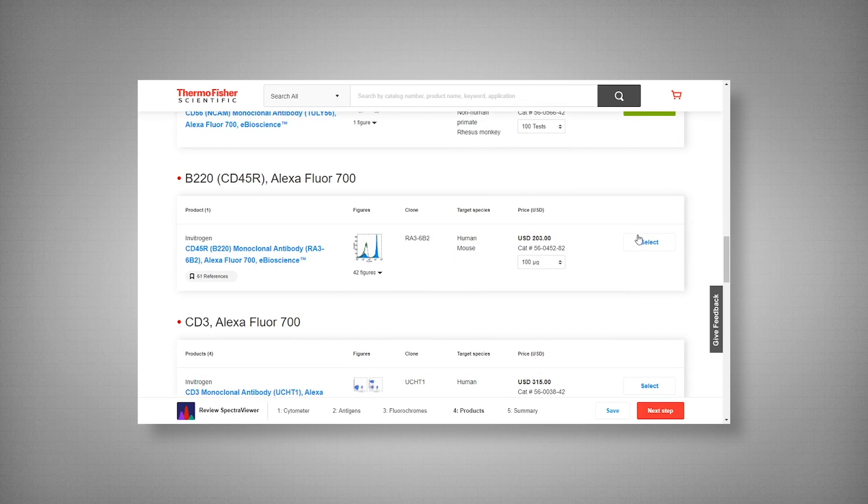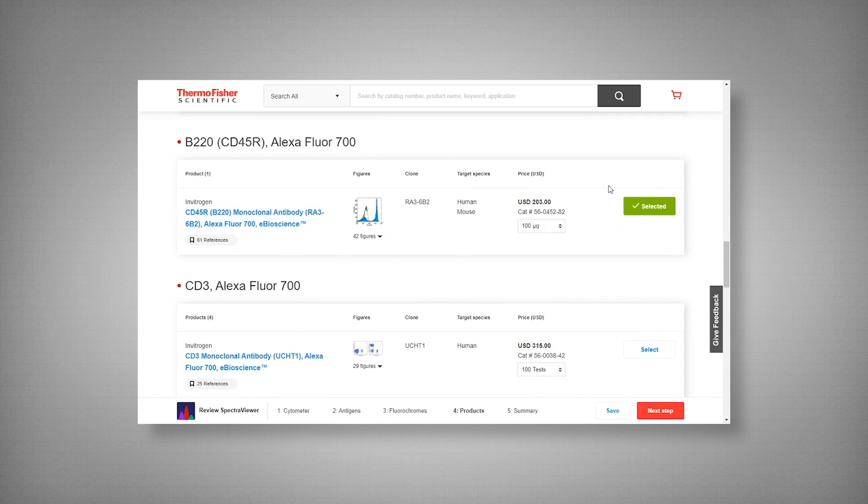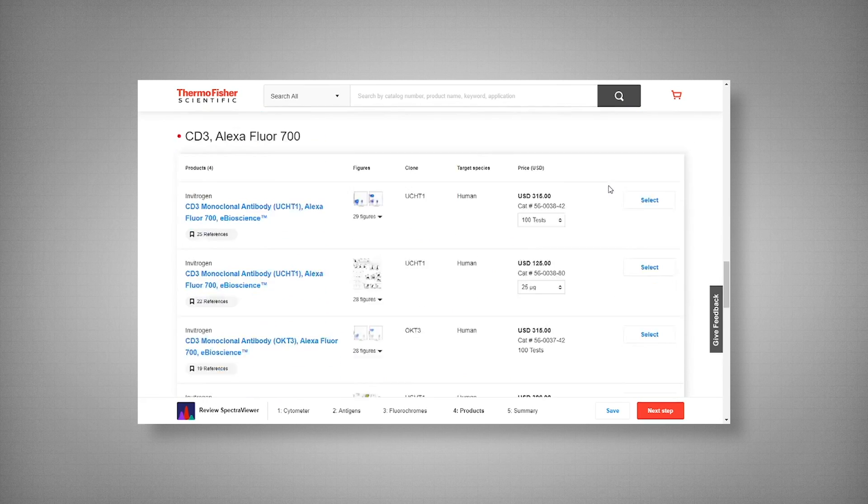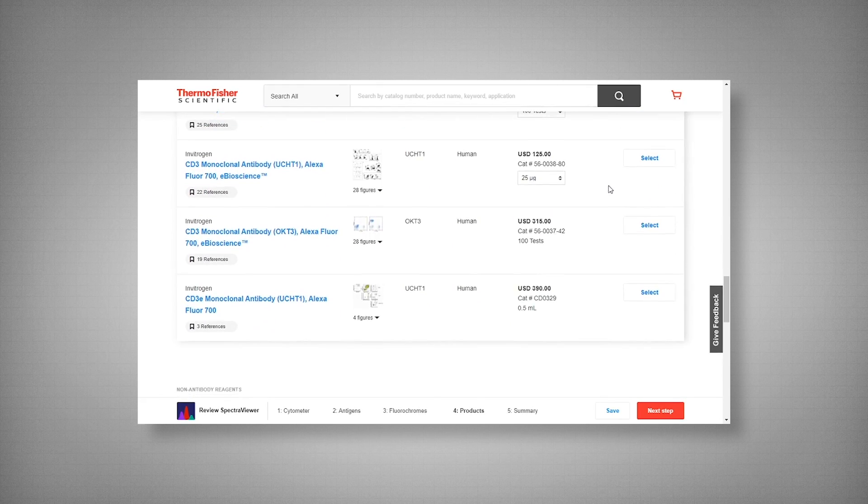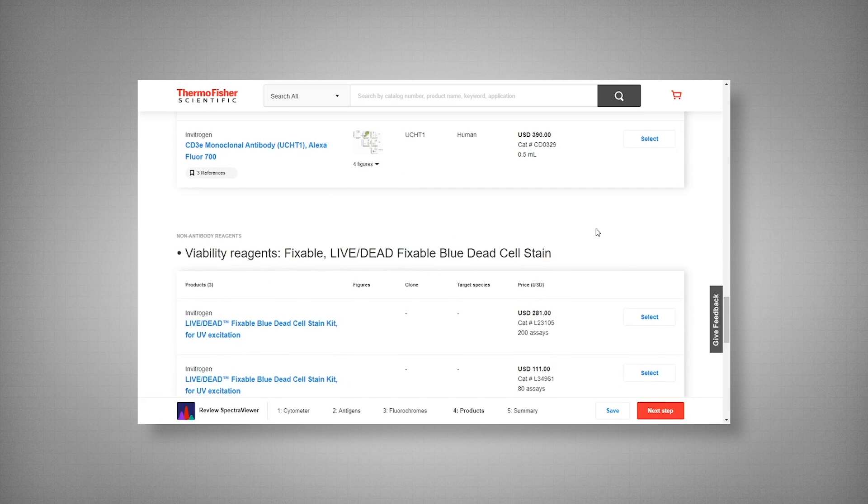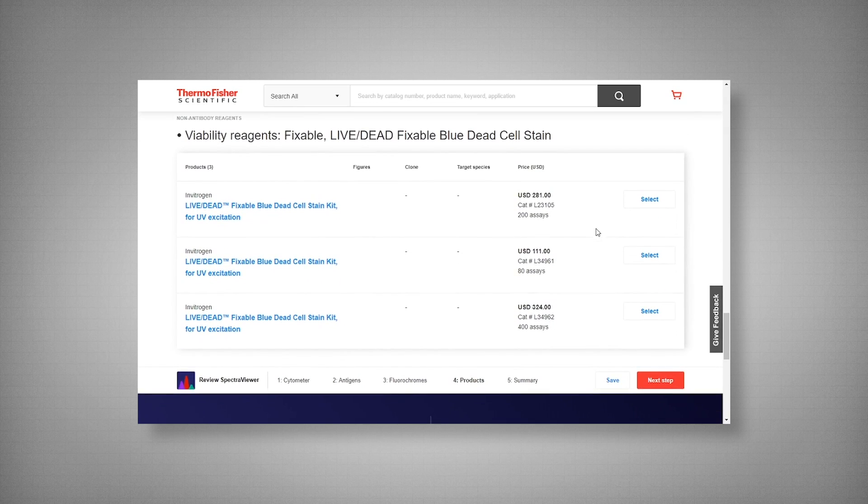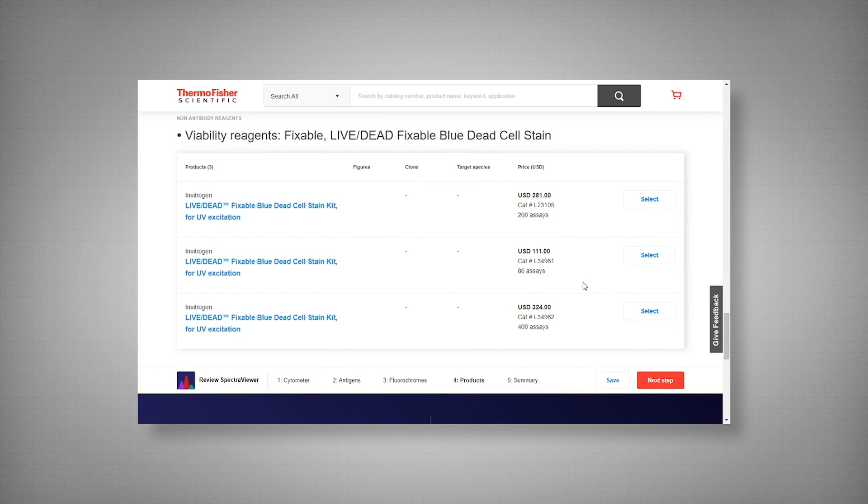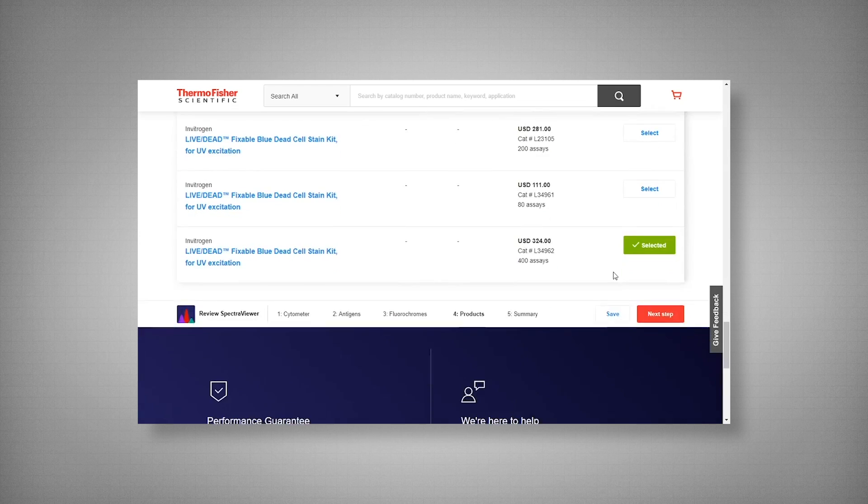And lastly we have our dump channel markers. Or not quite lastly because we do still have our viability dye. And CD3, one of my personal favorite clones to use is OKT3. It's a general T cell marker, commonly used. And here we have our live dead fixable blue dead cell stain kit. So when it comes to our analysis, we can focus on our live cells. And we'll just go with 400 assays because that's how great it is.